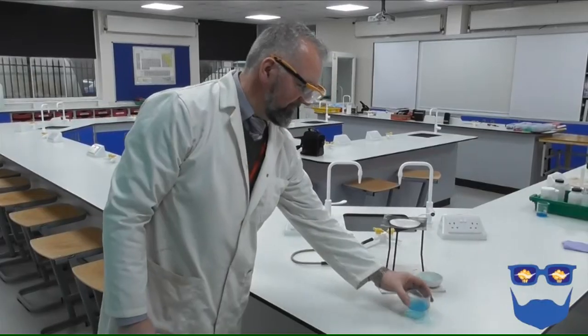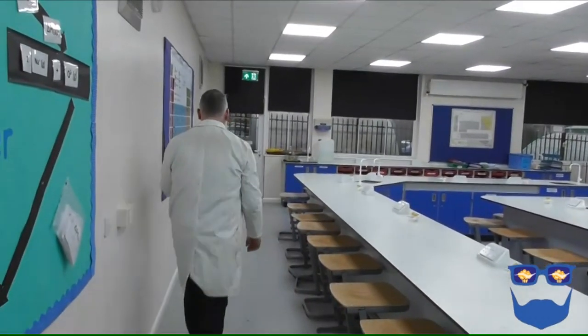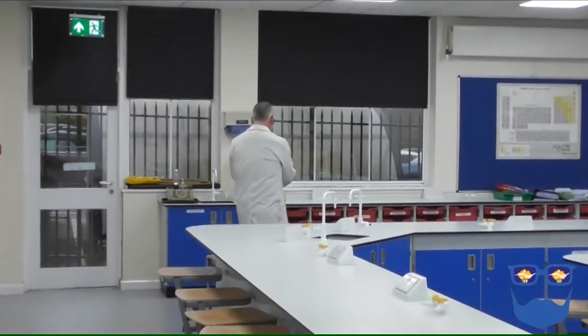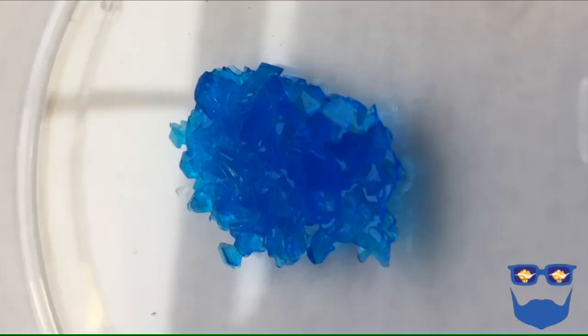As the solution cools and more water evaporates, you will start to see crystals form. You've got two choices: you can leave the petri dish until all the water has evaporated, or once the crystals have grown, you can remove them and dry them on filter paper. That's it — our pure, dry sample of our soluble salt.